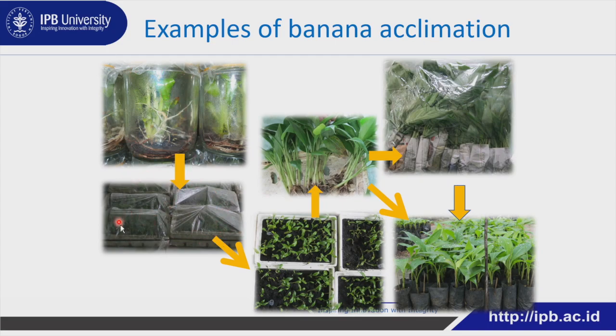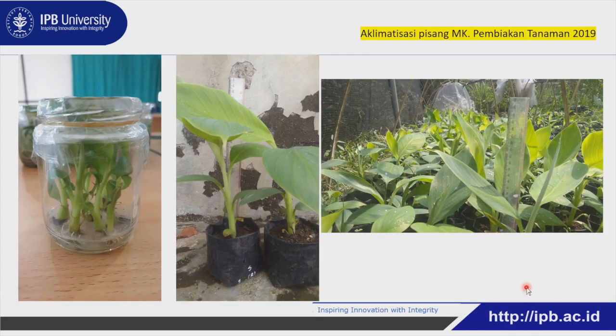So from this bottle, we put it in the media, I put a plastic cover to keep the RH, and after they can already survive like this, we can move the plant to another place, putting in a new media, or you can also transfer it and put it in a new polybag like this afterwards.